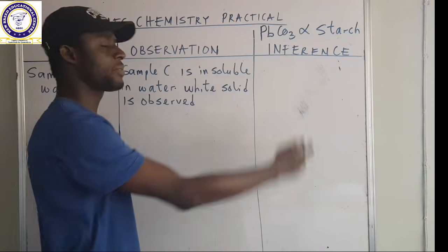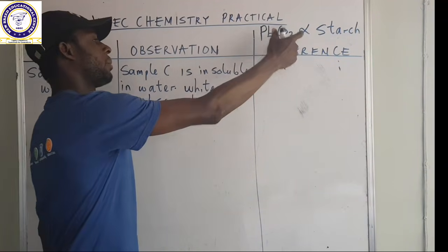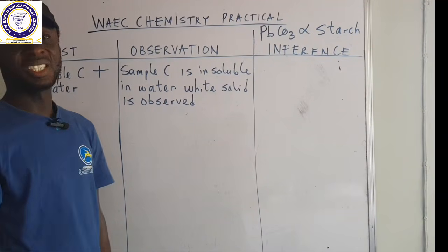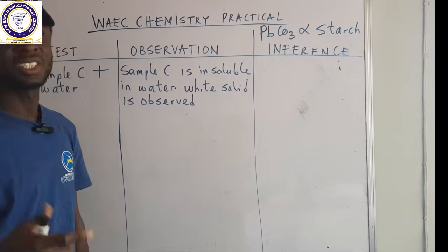So what is going to be our inference? Our inference is that our sample is insoluble.